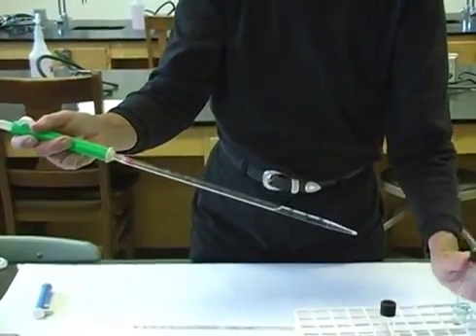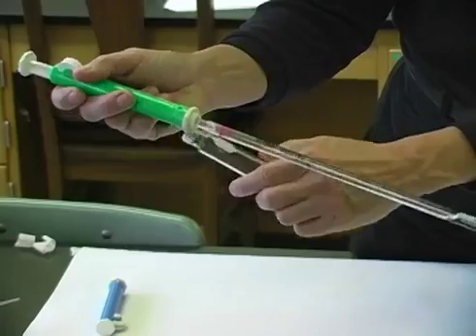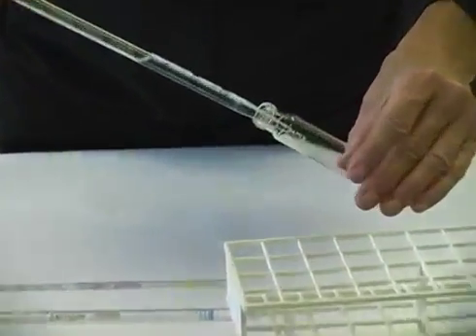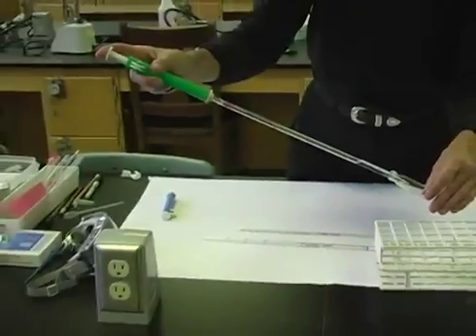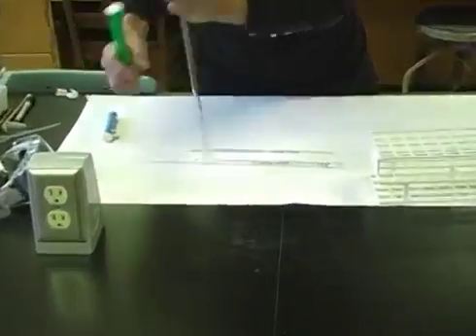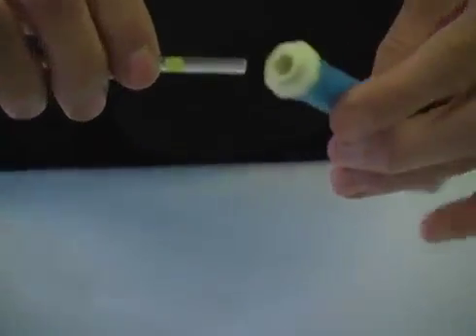To dispense our liquid into a new tube, we may either reverse rotation of the knob for a controlled delivery, or in addition, we may press down on the knob at the top of the pipette to deliver the full volume. 1 ml pipettes are used with the smaller blue pipette pumps again.